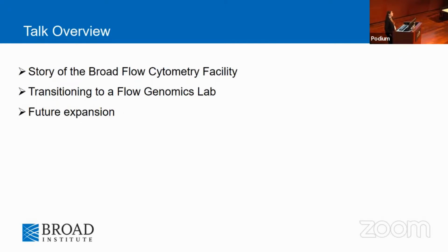People get so confused when they're new at Broad, and everyone tells them, oh yeah, go do 10x in the flow lab. And they're like, what? That's not typically where you go do 10x work. And then I'll briefly touch on future expansion. What am I thinking about in the next few years of adding to the facility, now that we already have a good pipeline for flow to genomics?